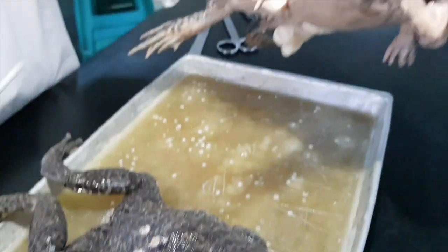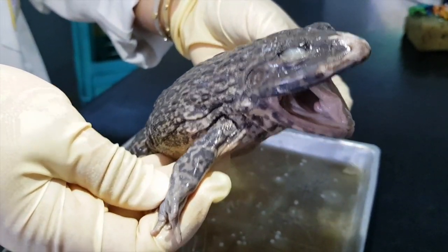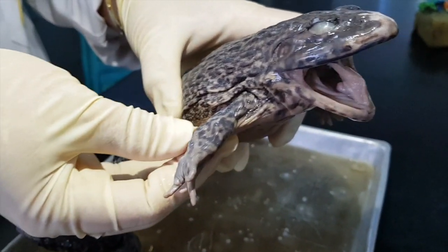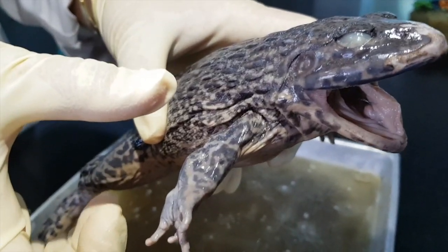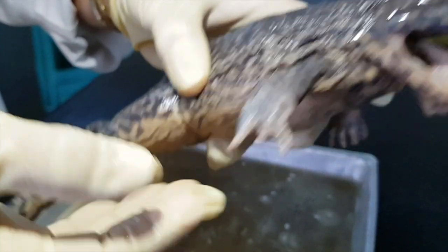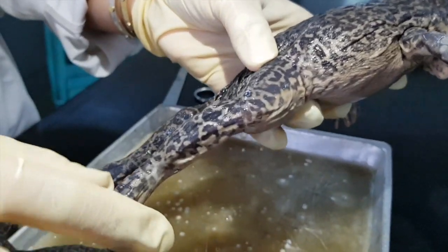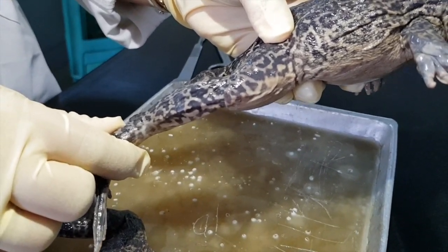And then you have the limbs. On the upper limb, there's the upper arm and the forearm, somewhat shorter, with phalanges or digits at the end.